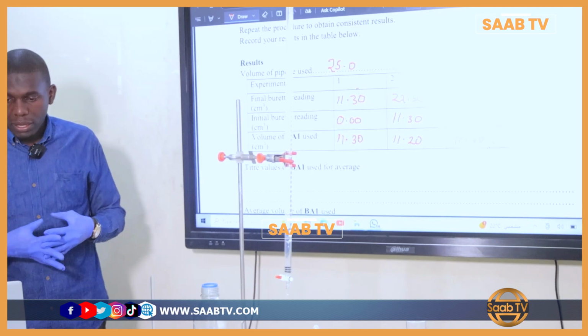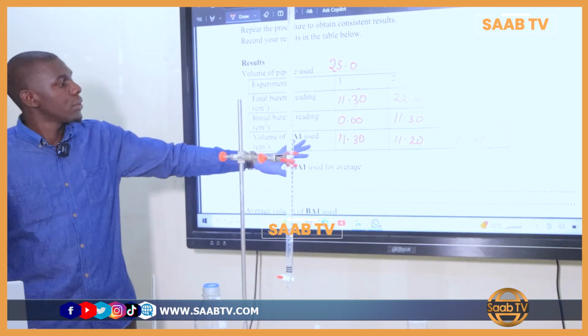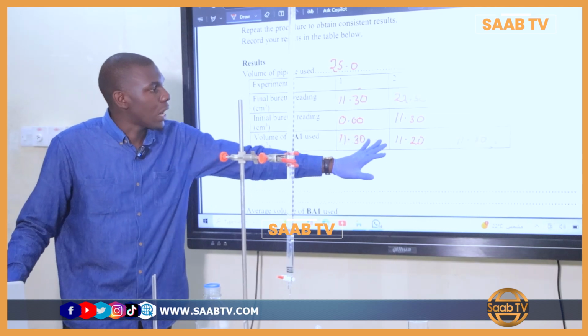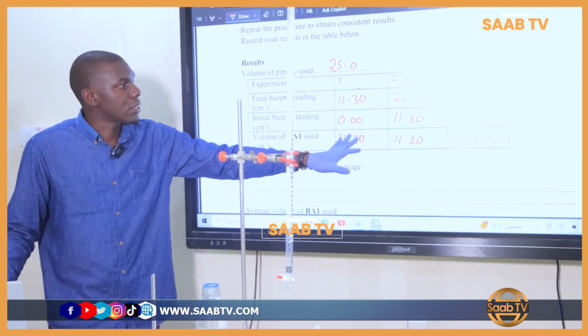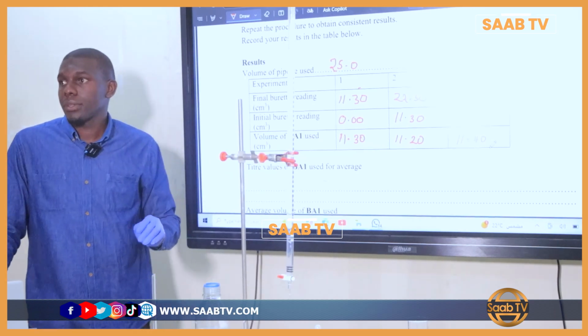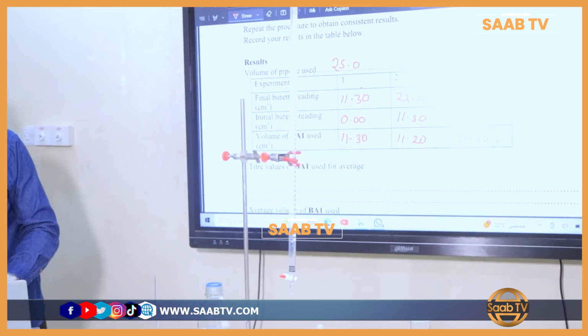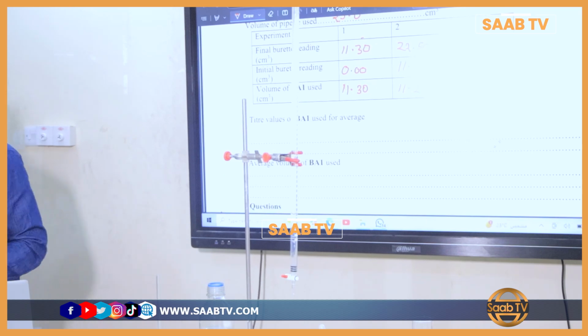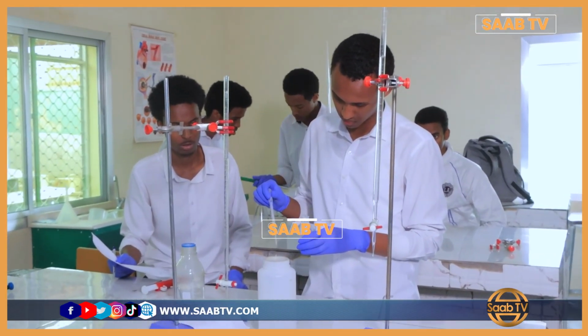So I'll take the first and second one, because when you try to subtract them, 11.30 and 11.20, what do we get? 0.1. Or you can even take the first one and the third one. It will be the same thing. Is that clear? So the titer values for BA1 used, I will take 11.30 and 11.20.